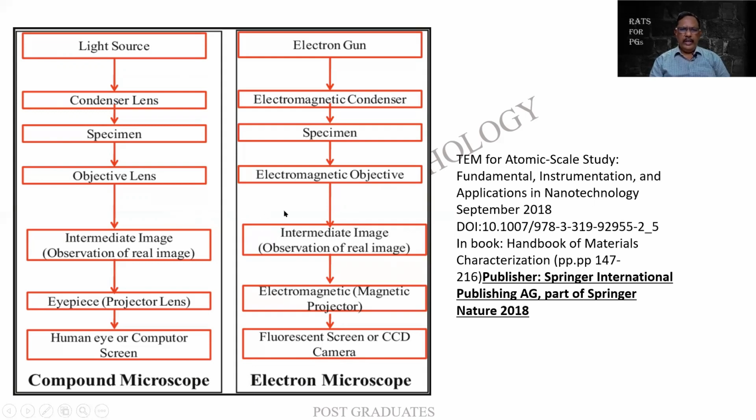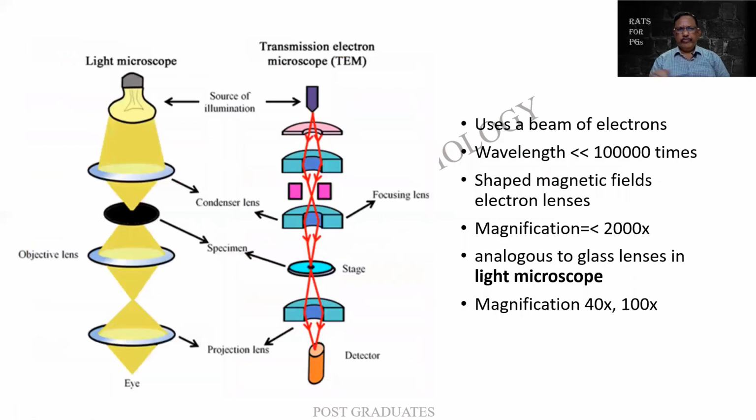So these two I would like you people to kindly compare rather than memorizing, and see how much you people can recollect. This is it. So for a comparison, I had mentioned it. Actually, as I told you, this light microscope, it should have been the other way around. You find that there is a light source. It can be artificial illumination or a mirror. And then there will be the condenser lens. You have got a specimen over here. And there are the objectives. And finally, it goes to the eye, from where the image is getting formed.